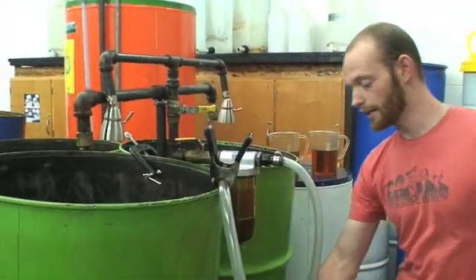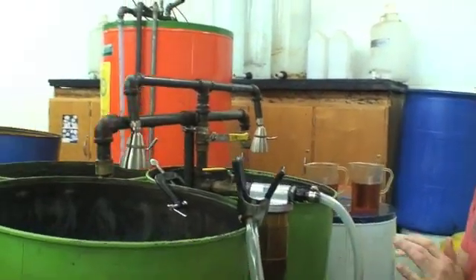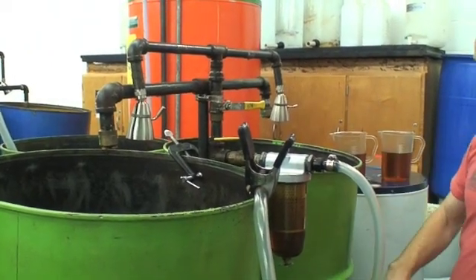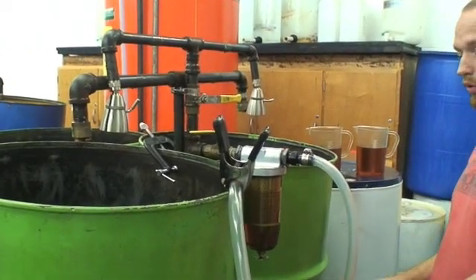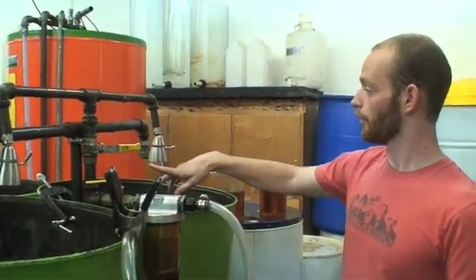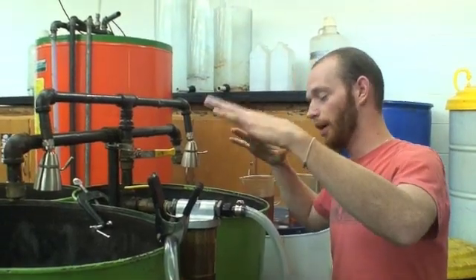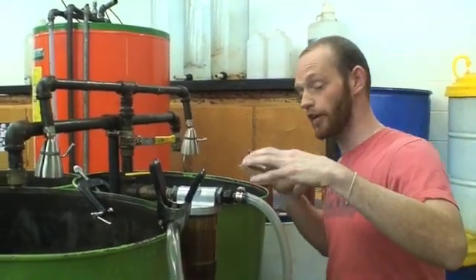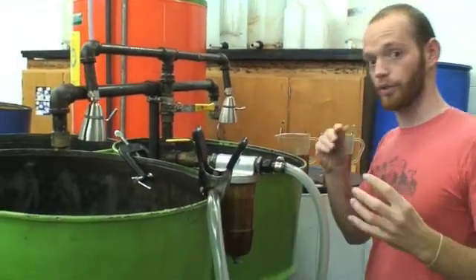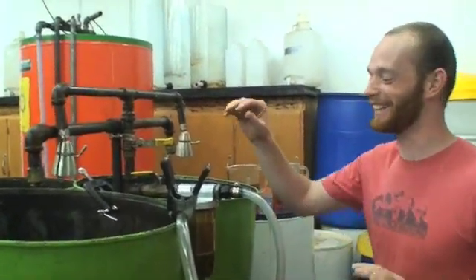We stop before any biodiesel escapes and then go to the washing process, which involves filling water into both tanks to the same level as the biodiesel — through these misters — which dances upon the surface and contacts all of the surface area of every bit of the biodiesel to get out all of the impurities and catalysts.